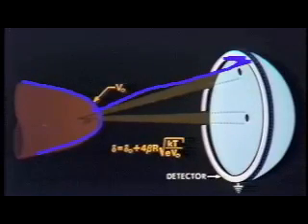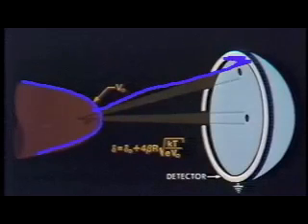The way we see atomic detail in this microscope is by cooling the surface of the specimen and thereby cooling the helium gas that collides with the surface before it's ionized. Because a helium ion that's formed in space above one of these edges will have some thermal velocity component parallel to the surface, and that velocity component will be preserved as the ion flies off to the screen.